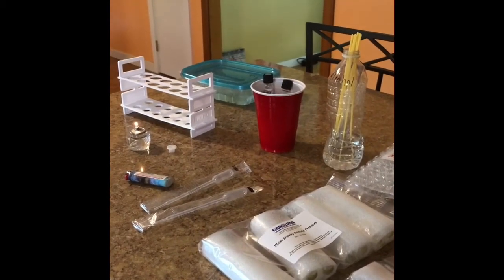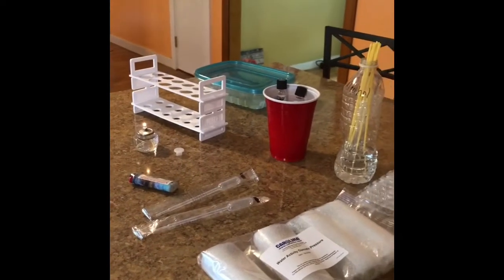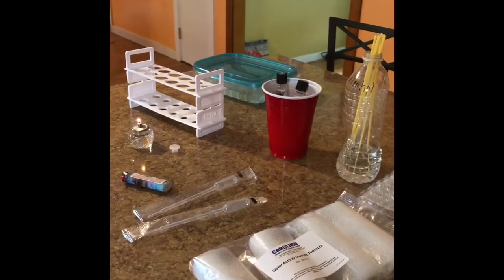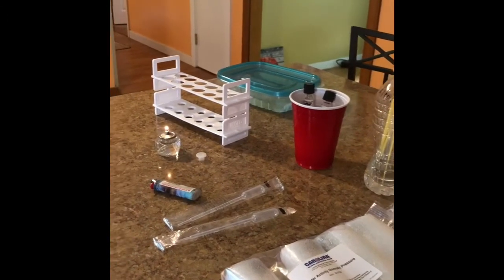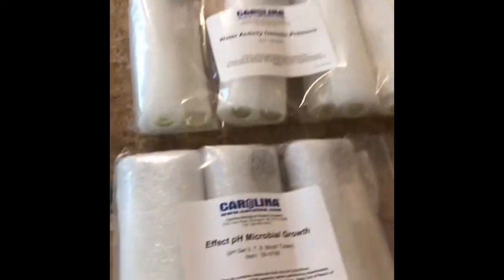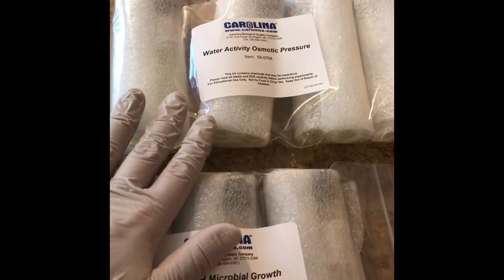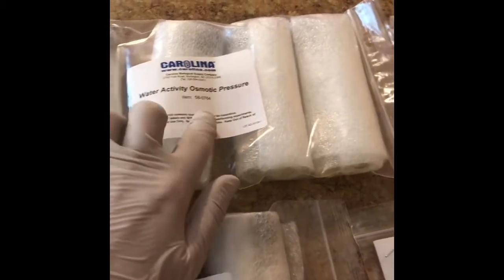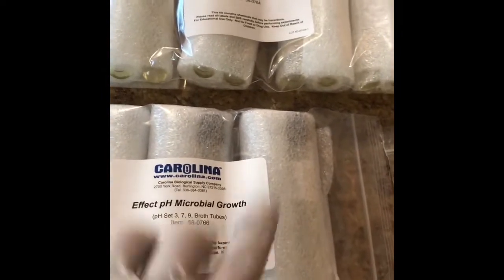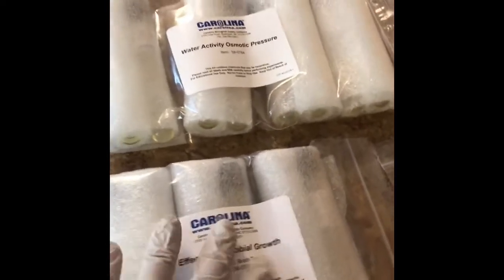I just wanted to show you how I'm going to be setting up for and what you'll need for week 4's labs on osmotic pressure, pH, and selective and differential media. So out of the kit, these two sets of media stayed in the box. They were not refrigerated. So this is water activity, osmotic pressure, and this is effect of pH on microbial growth. I'm going to be using these on Sunday when I inoculate my cultures.